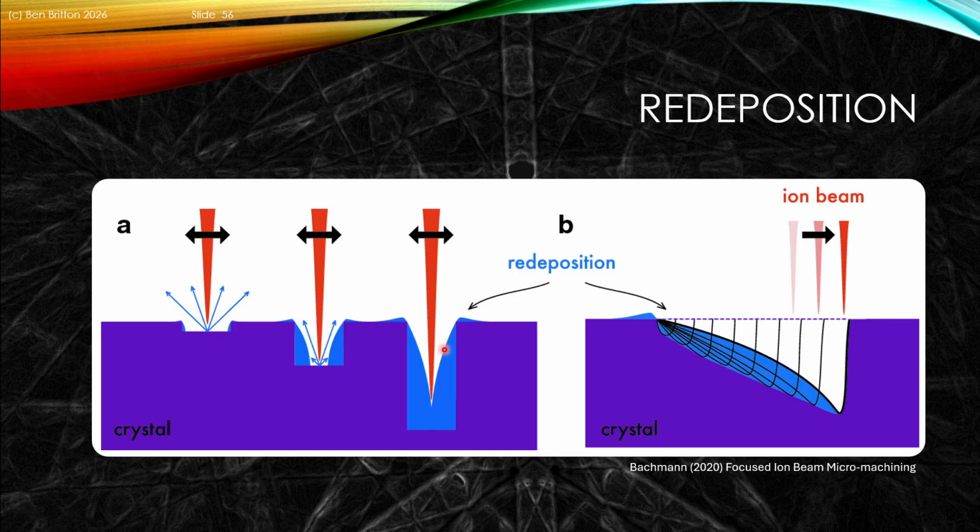Now, a way for us to improve this is that we can effectively scan the beam, pushing forward to different depths so that the redeposition is ejected forwards. When we mill at this point, we're going to remove the redeposition, some is going to go backwards, but each time we're milling for an increased time, that enables us, by the time we're done, to have relatively little redeposition on the cross-sectional face of interest in the object.